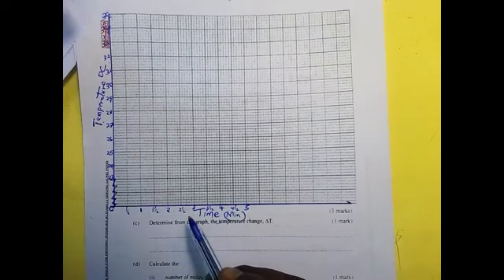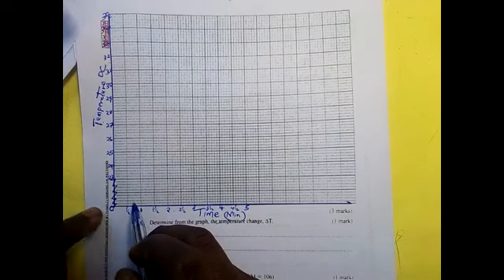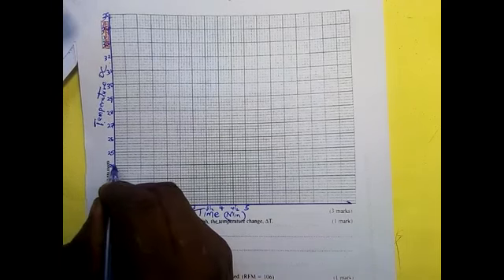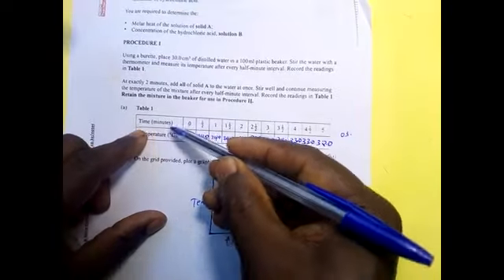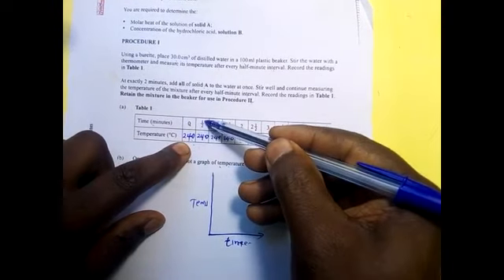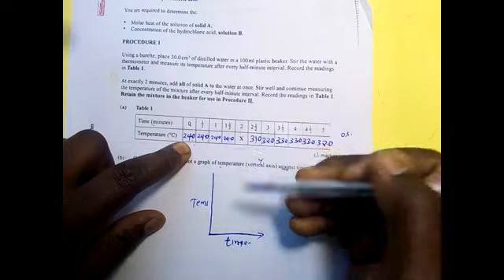The next thing is now to plot the graph. When time was 0, our temperature is 24. So you should always remember this information here. When time is 0, temperature is 24. When time is a half, 24. When time is 1, 24. When time is 1.5, 24. So that is what we are doing.